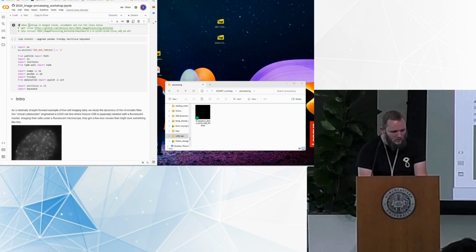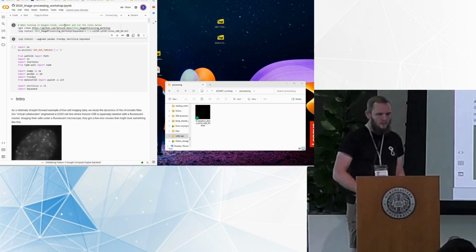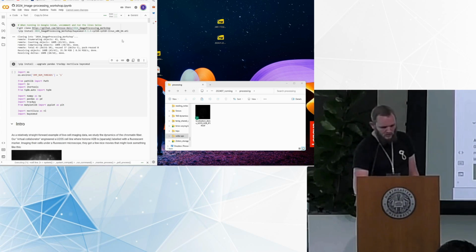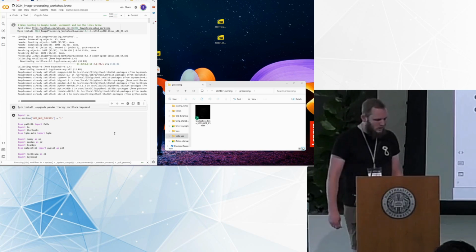If you run in Google Colab, you can use this first line here to clone the repo locally to Google Colab, which will give you all the data and folder structure, and then install the local version of this library that I checked should work with Google Colab. Otherwise, you basically start from this first cell here and just install dependencies locally.